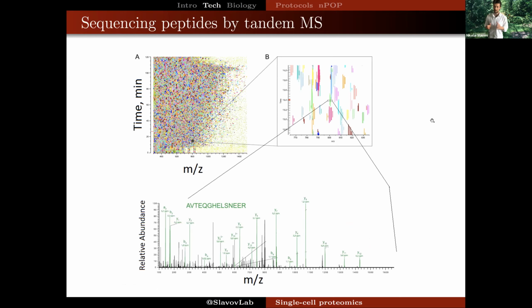I'll give you this 1 minute, 1 slide introduction to a common approach to mass spectrometry analysis, taking into account that many of you may not be familiar with mass spectrometry proteomics. Most quantitative approaches require some form of protein or peptide separation, which is done by liquid chromatography or capillary electrophoresis commonly.